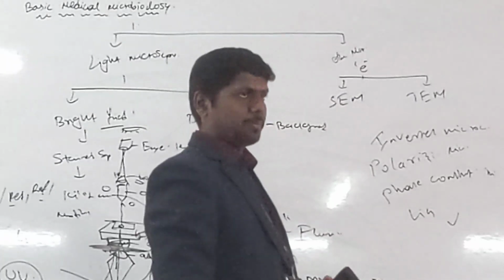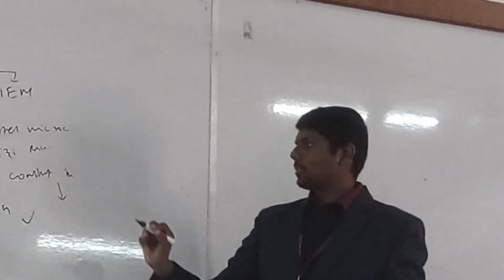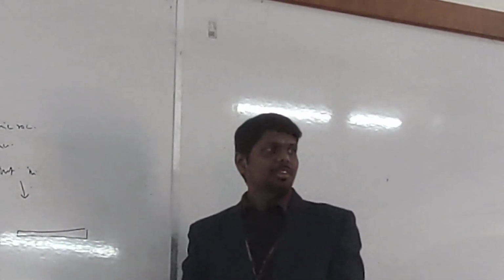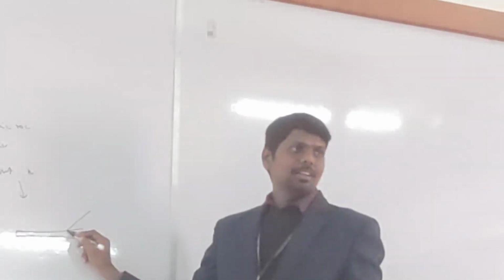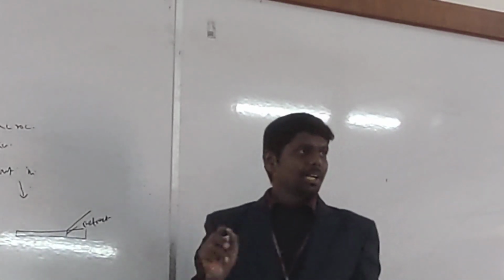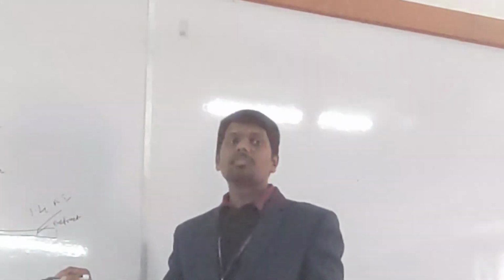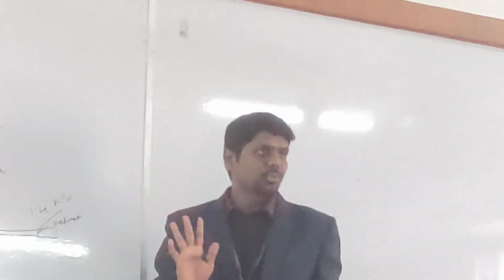Coming to the phase contrast microscope. The idea behind the phase contrast microscope is like this. Do you remember what the refractive index of a glass slide is? Can anyone say? Light will bend when it is moving from air to a solid medium, right? That bending of light is called refraction. We have standardized the refractive index of a glass slide, the microscope glass slide. That is 1.4. The bending of light will be 1.4.